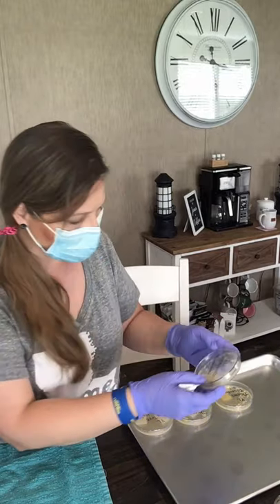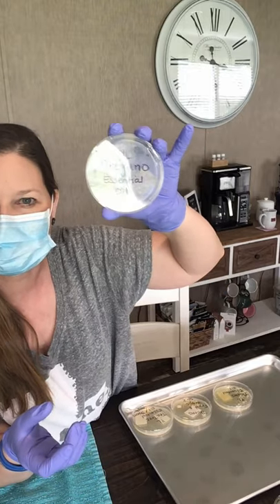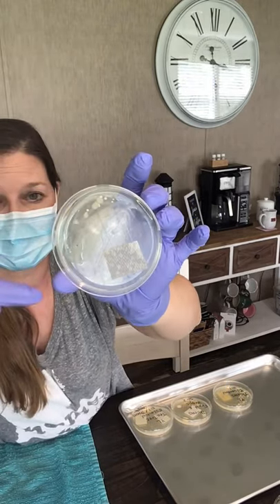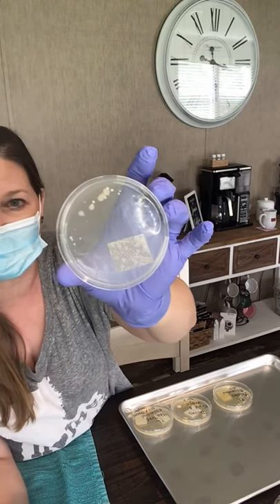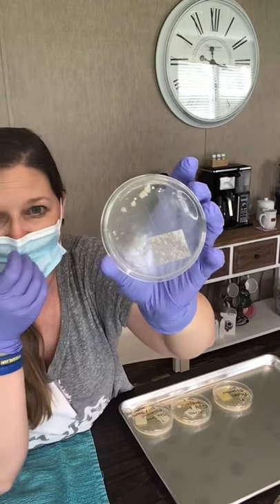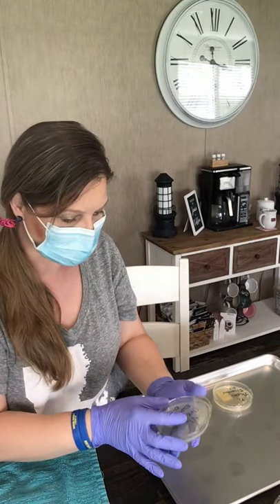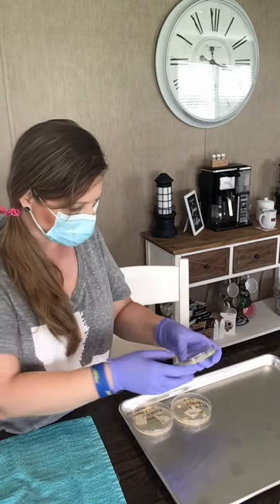Okay, YL Oregano essential oil here you go. Y'all there's like nothing in this petri dish except on the outer edges, far away from the original spot that the oregano essential oil was. That is mind-blowing right there. Here's the back of it — hardly anything. I have to do experiments to prove to myself, because even though other people do it I still have to do it myself.